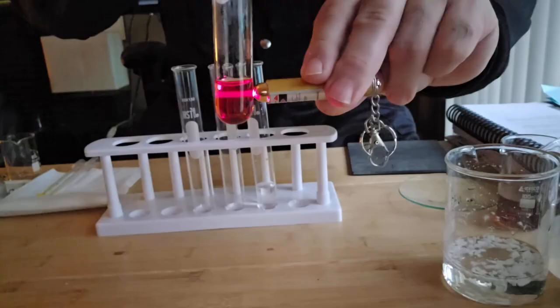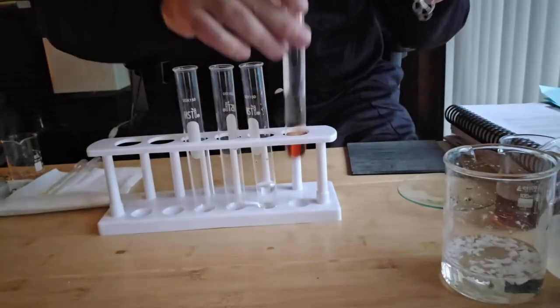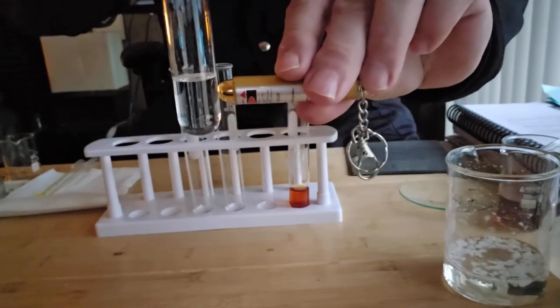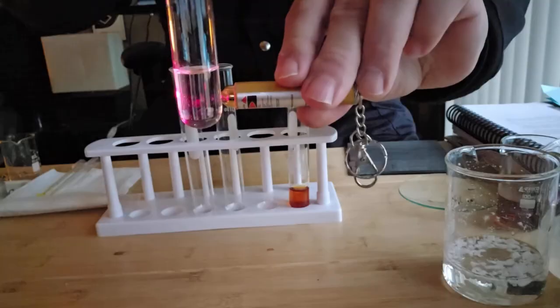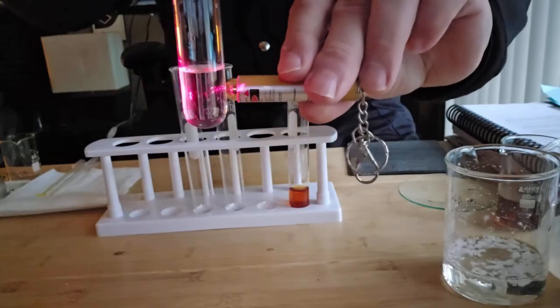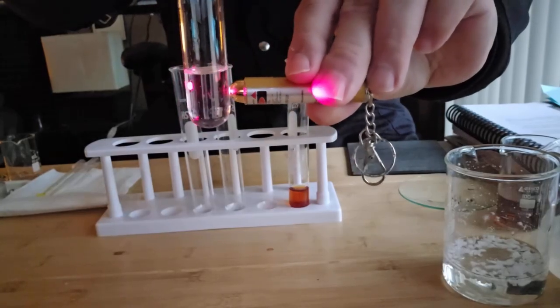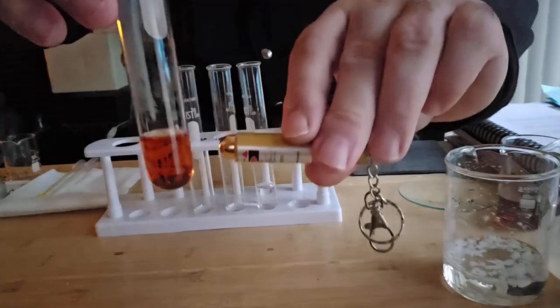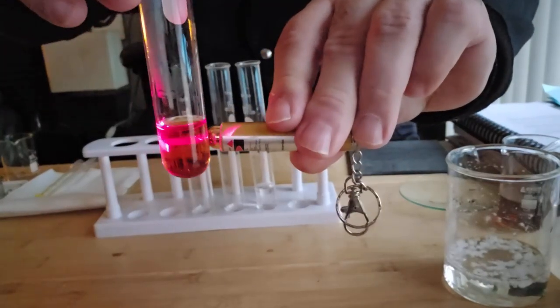Let's do it with the sodium chloride as a control, and you do not see the beam going across the solution like you did with the sol colloid.